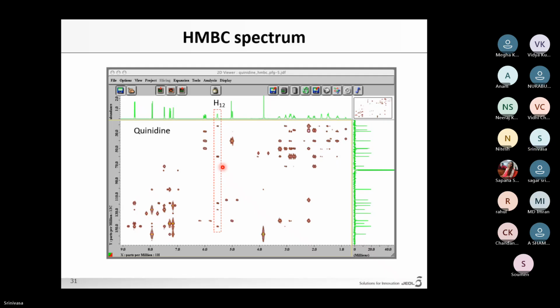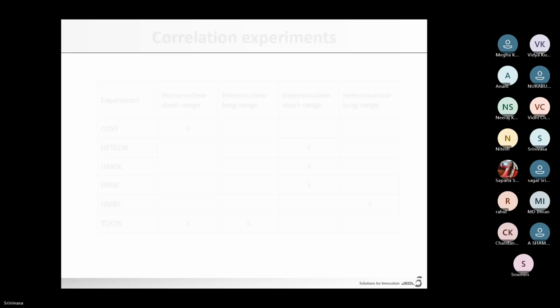I'm just giving a brief introduction and I'm not going into detail about each experiment. You can easily find the literature online and get that information.